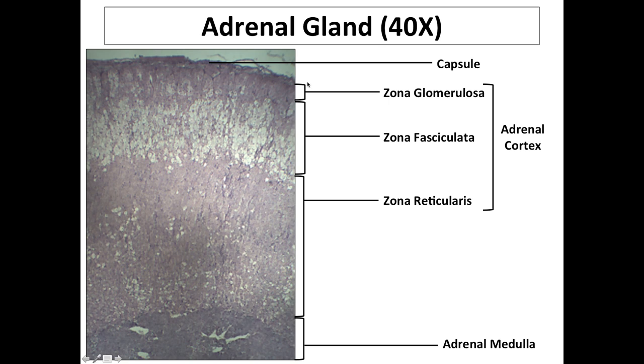Once you've identified each one of these as the adrenal cortex, then it's easy to distinguish them from the innermost region called the adrenal medulla.